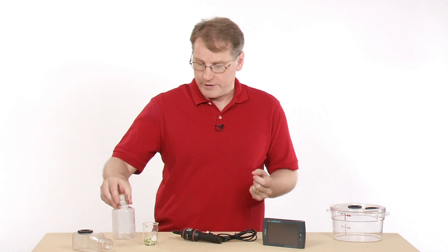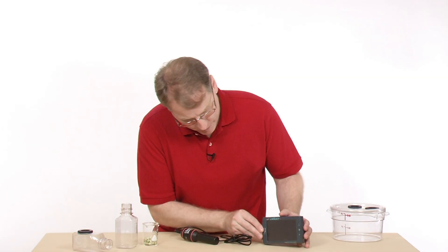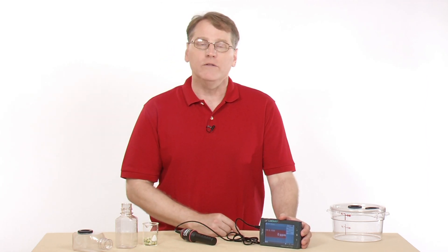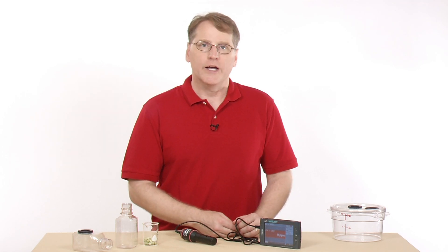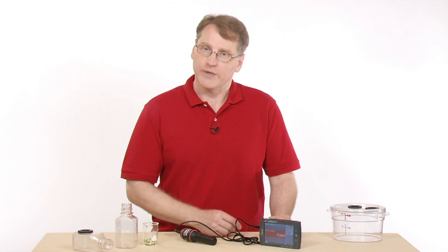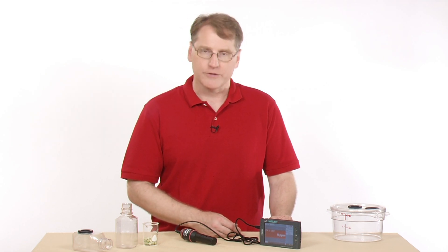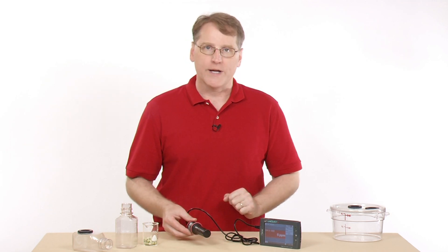Now we're ready to collect some data. We need to plug the CO2 sensor into our LabQuest. Once it goes in, the device is currently reading zero parts per million. It needs to warm up, and it will continue to give us a reading like that until it's warmed up — that takes about 90 seconds. I want to make sure I have it on the lower range setting.